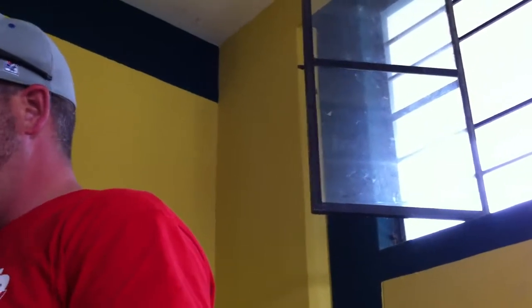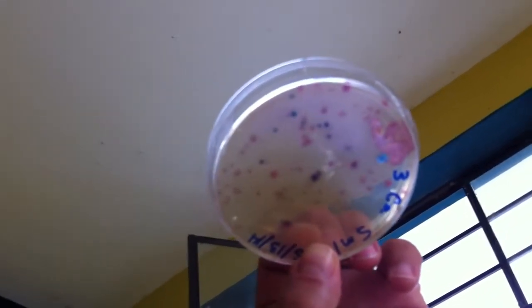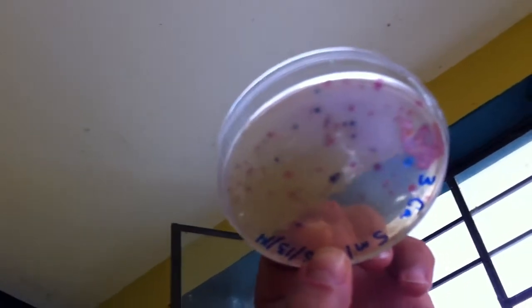Yay. Good. All right. This is a sample we're drinking from a canal, where they're going to get their water. Blue would represent E. coli, the presence of E. coli, and pink would represent gram-negative, potentially pathogenic bacteria growth. That's one of the canal samples.